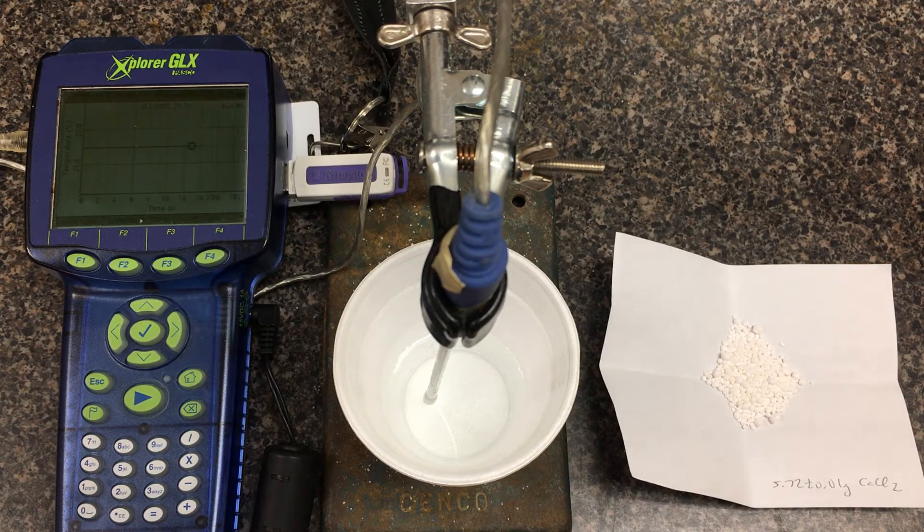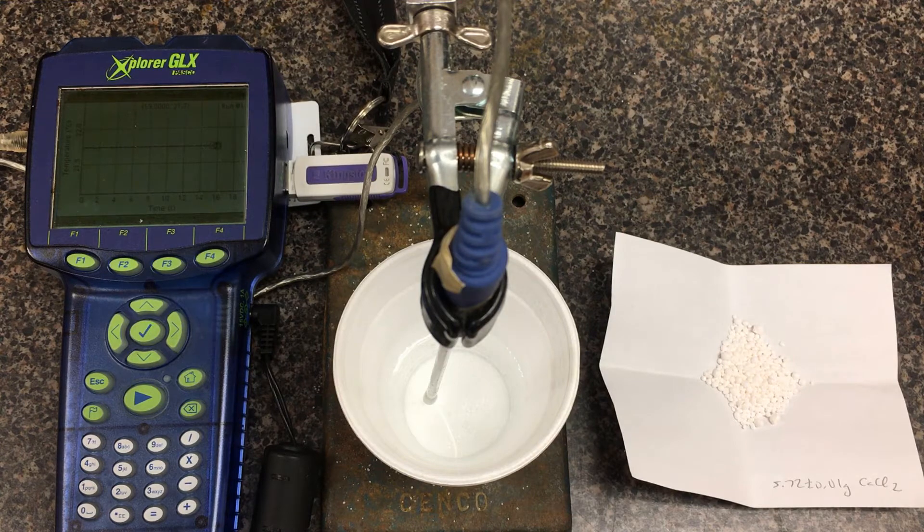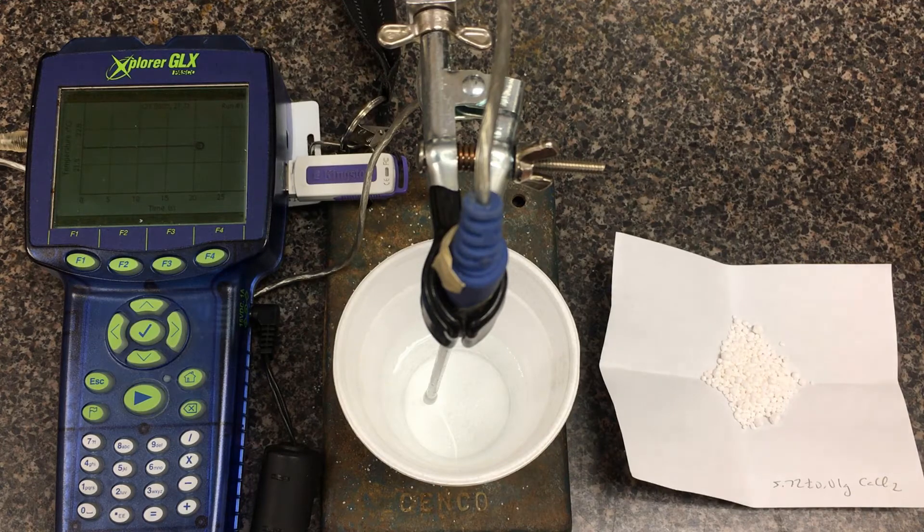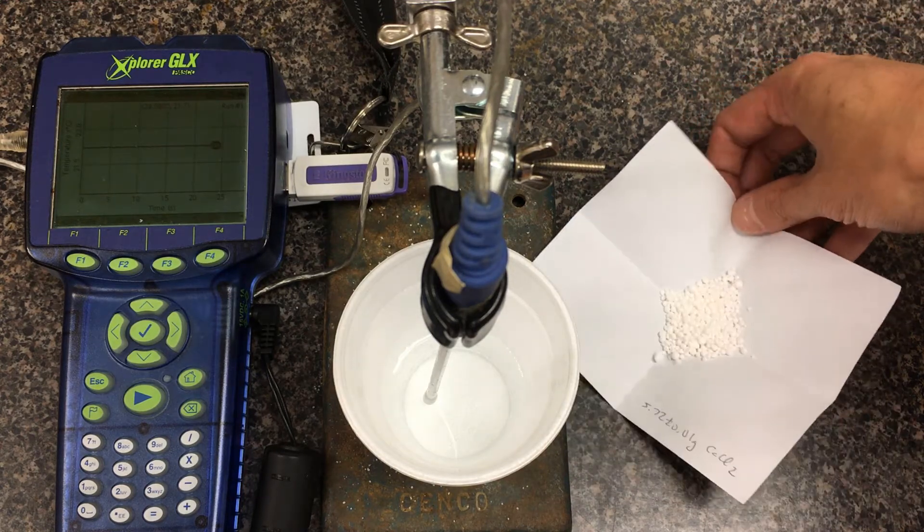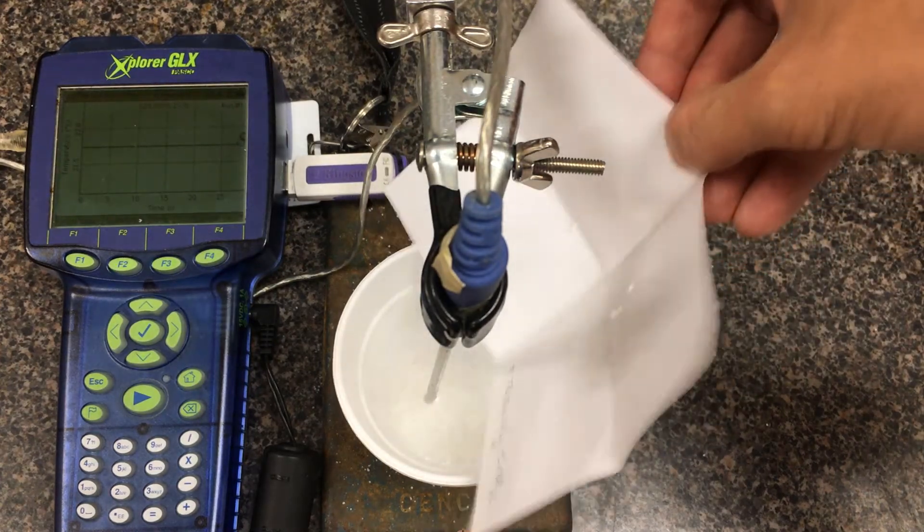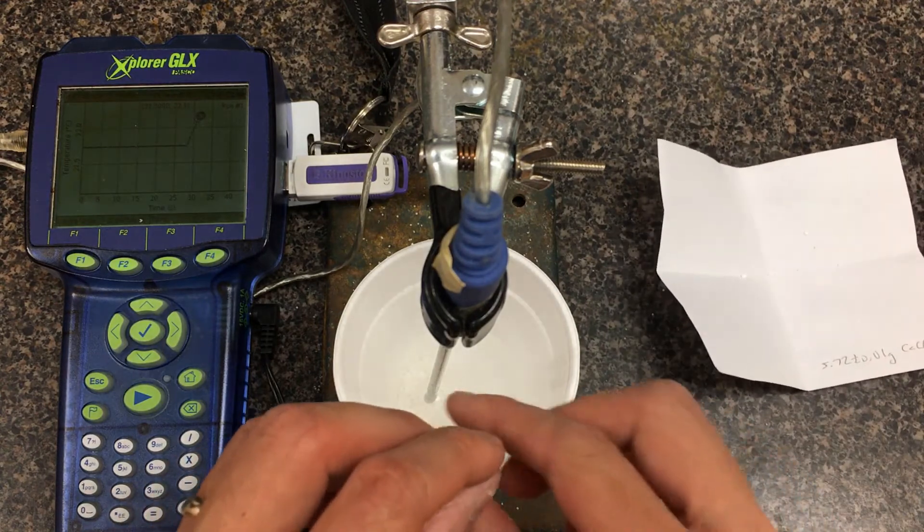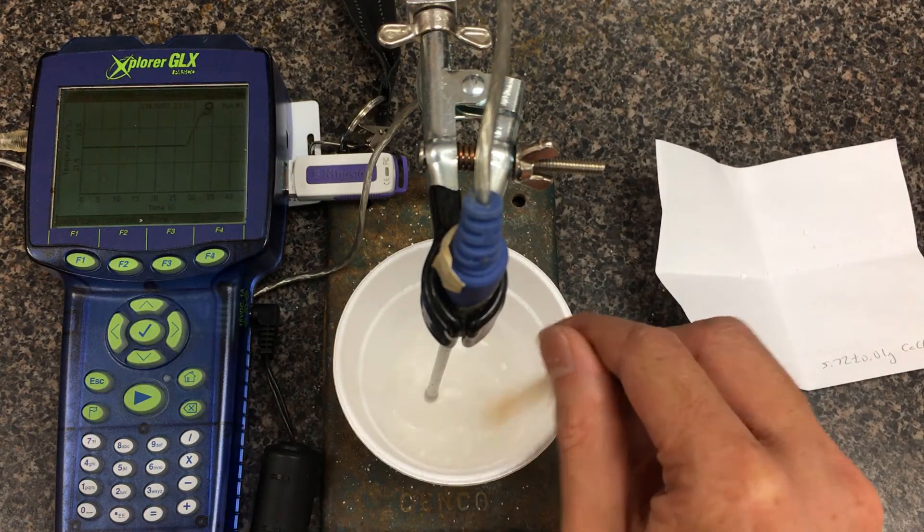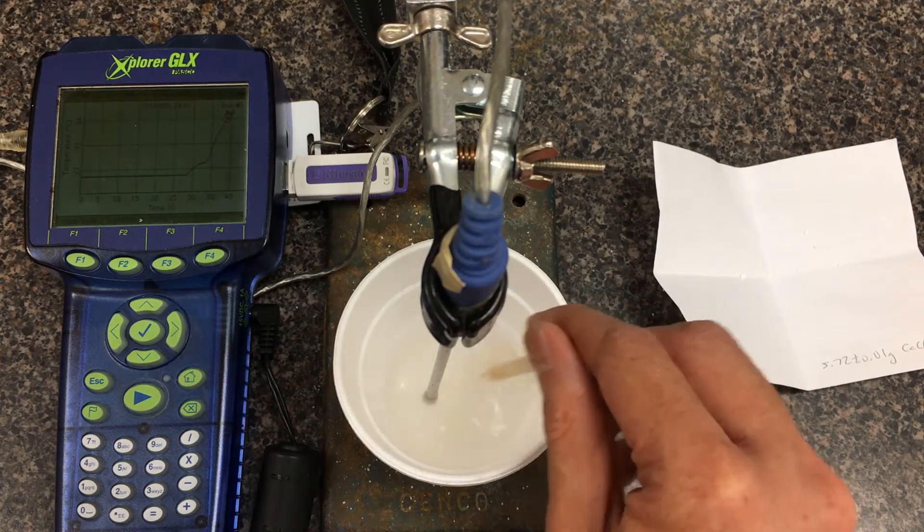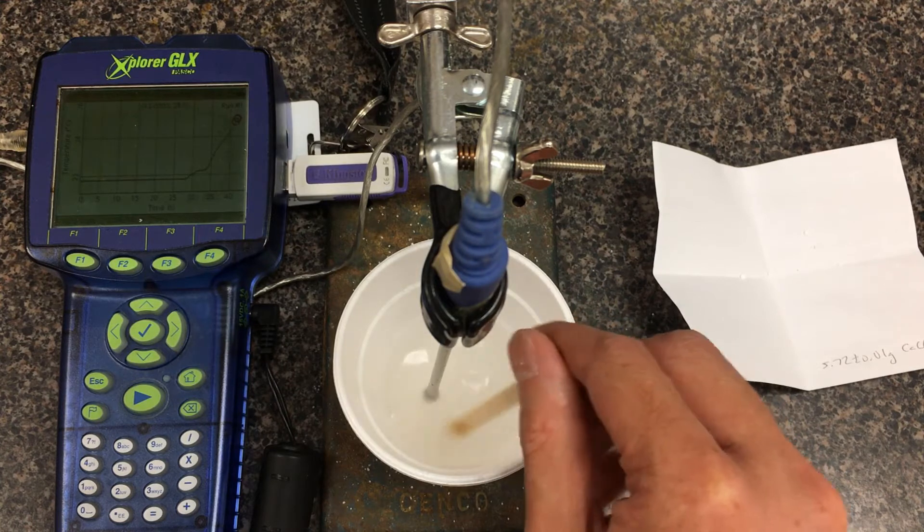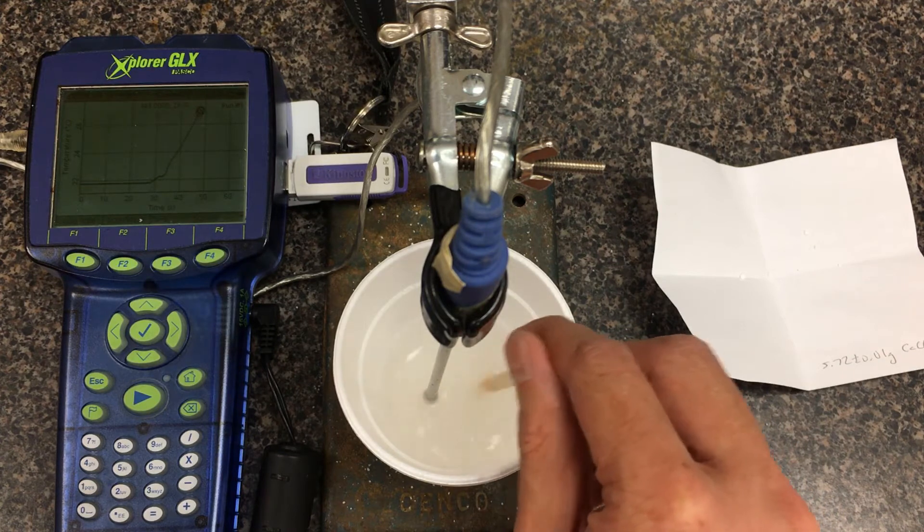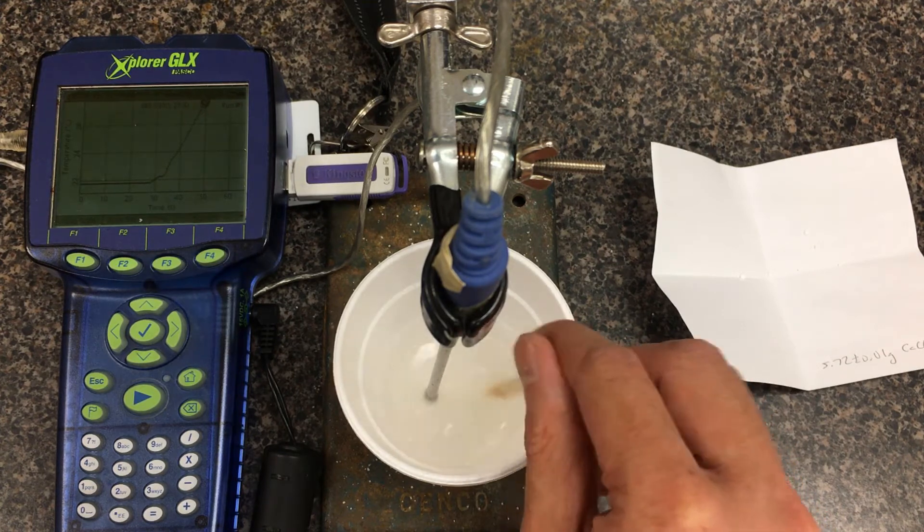Give it a couple seconds to get a baseline. If you want to auto-scale, press F1 to zoom in. I have my wooden splint ready to do any stirring. I'm going to minimize heat loss if we can. We'll slide this in. I'm going to fold this in, so that gets in. Just doing a little bit of stirring.